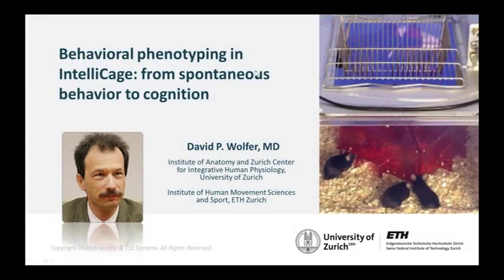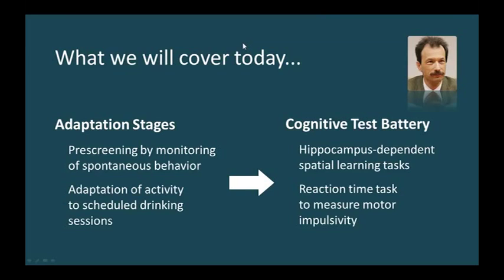Okay, so hello everyone. Thanks for the nice introduction, and also thanks for the opportunity to present here at this webinar. What I would like to do today is to show you a few examples of how we use IntelliCage with mice, ranging from the observation of spontaneous behavior and then moving to some more complex cognitive tasks.